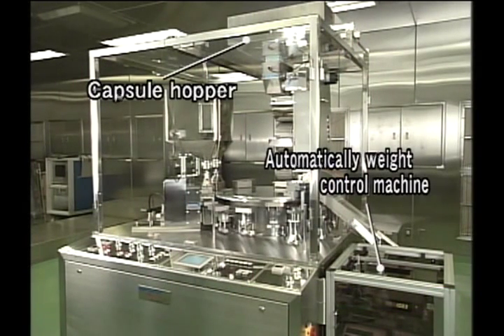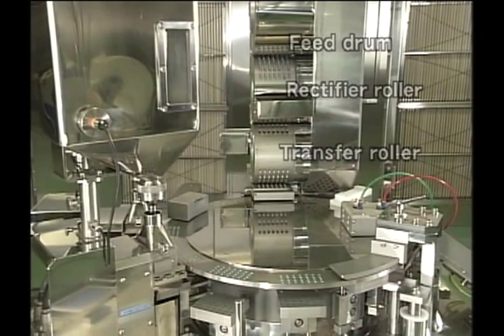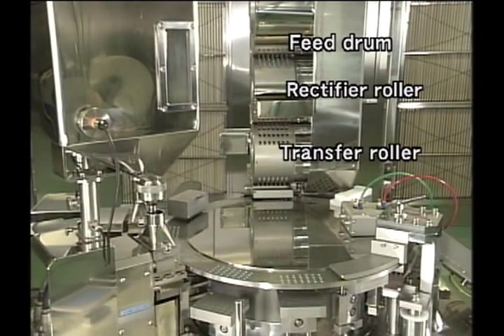First, applying a mechanism that controls the orientation, the empty capsules are transported from the hopper by the capsule rotary rectification system, which prevents any shortage of supply.